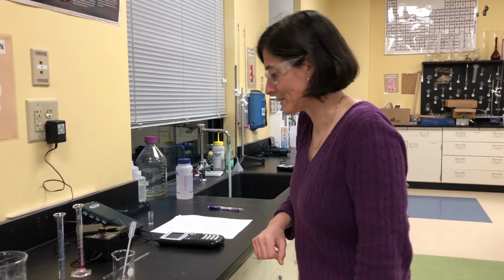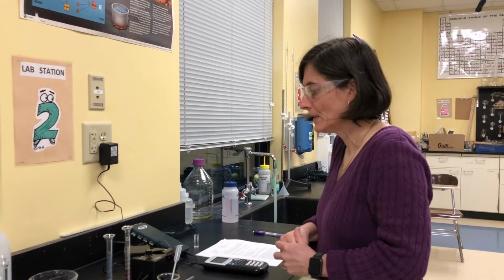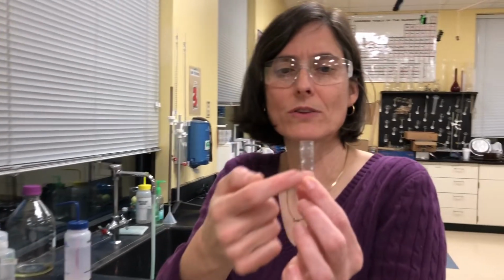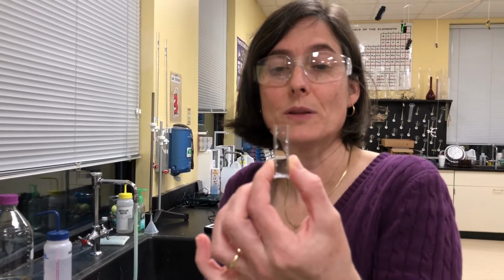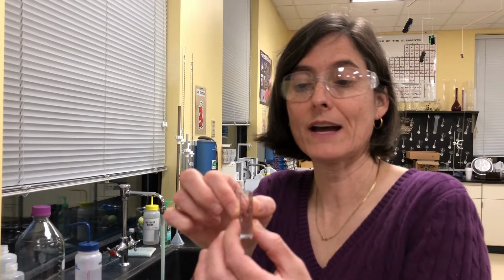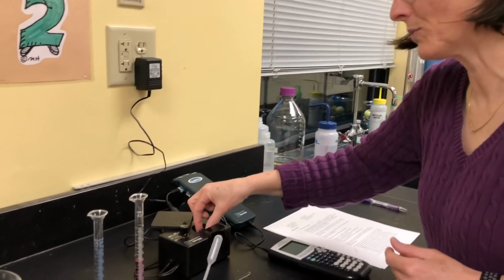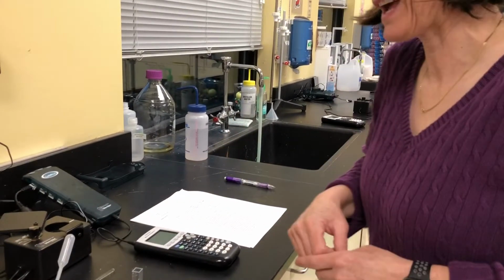chemical in this reaction. Okay, now before we can actually dive into the reaction, there's a few things that we have to go over and understand. One, this is called a cuvette, and it has ridges on one side and it's clear on the other side, and there is some water left in it from the previous reaction I did. You always want to touch it on the ridged side, because when you put it in the colorimeter, you're going to put it in the colorimeter with the clear sides. So you don't want to touch those because a fingerprint on that side could affect your data.